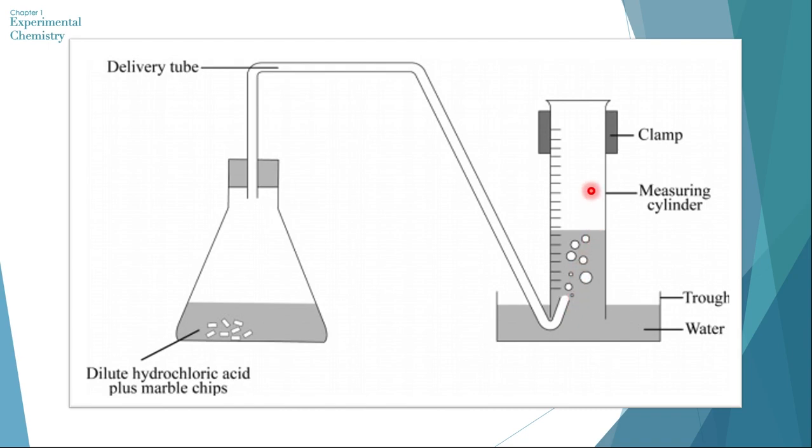But remember, we don't pass a gas through water without any reason. I mean, of course, it's not just water that is here. It is also sulfuric acid. So sulfuric acid, of course, contains water. So we still cannot pass a soluble gas through the sulfuric acid because it will again get absorbed in it.